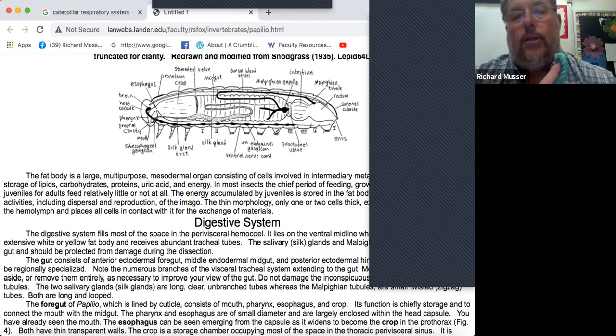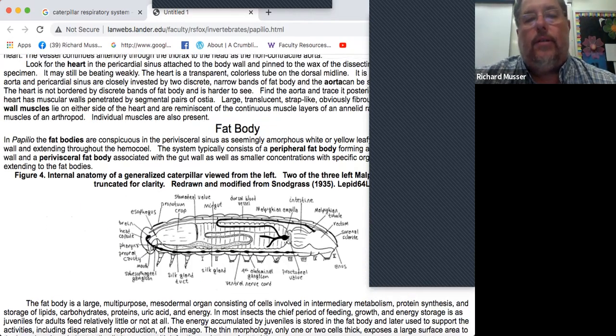The salivary glands are huge. They'll actually leave from their mouth and float around in their body and can lead all the way down to the last abdominal segment. There's several segments, about eight of them, and three thoracic segments.